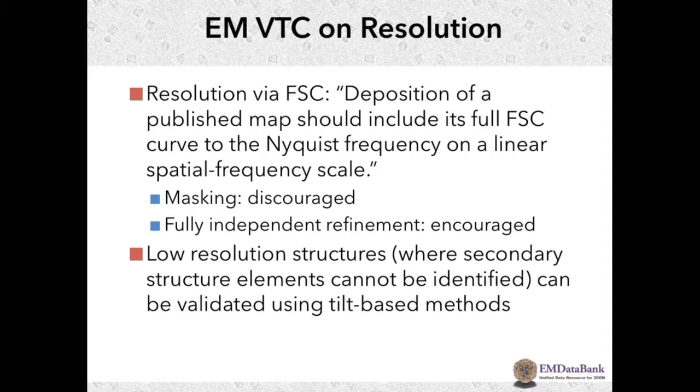I guess the problem is actually setting up to collect tilt pairs. Does anybody do it here, Ed? No, but we do collect tilted data. Yeah, rather, with conical tilt you can indirectly do that analysis. More people probably should do that validation, but if you're near atomic, it might not be so crucial. Right. Exactly.